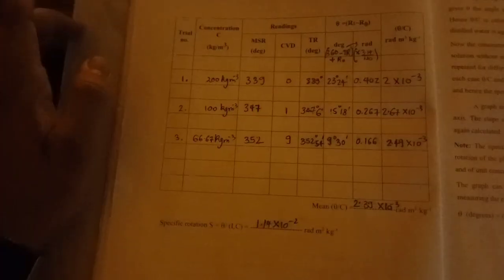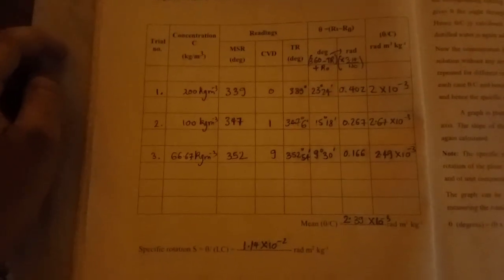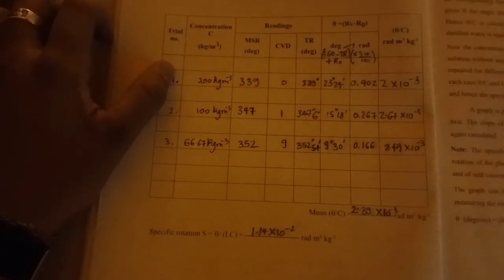You might remember that when you took the reference reading, the two halves were equally dark, or equally bright. Now when you fill the 200 kg per meter cube concentration sugar solution, it will no longer be of equal brightness. One side will be darker than the other, or alternately brighter.